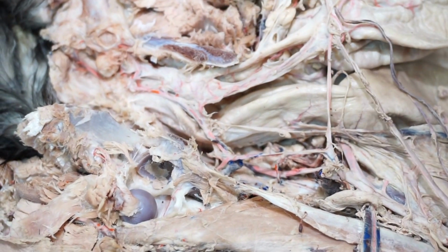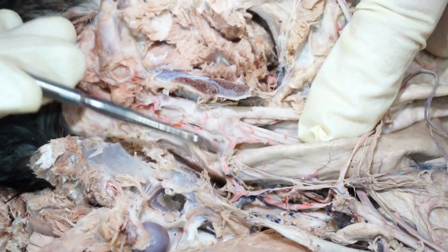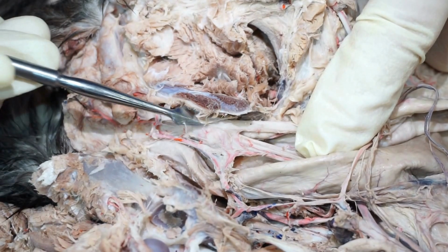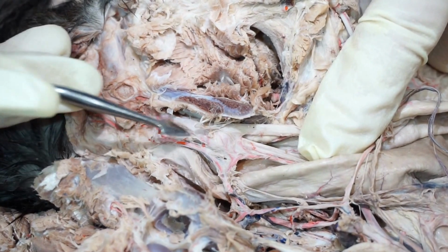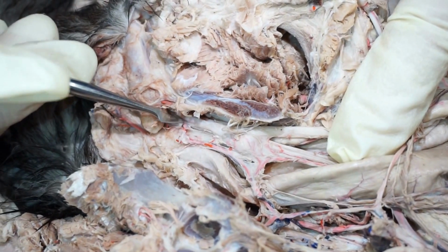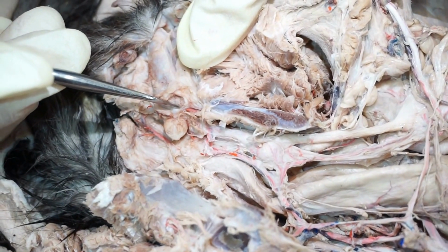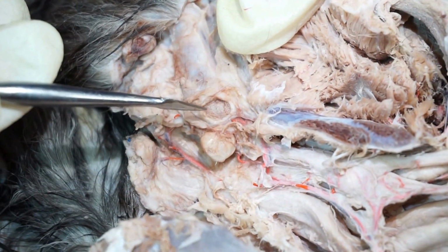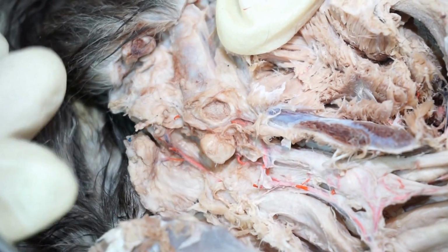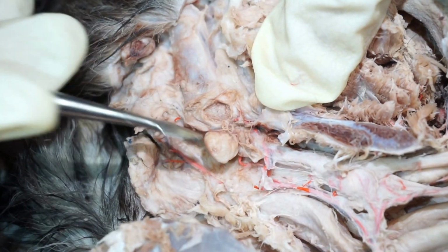I want to point out a few other things in this cat that are unique. In terms of accessory sex glands, we have a little prostate in this cat. Let's move a little bit farther down that pelvic urethra. And right as we start to turn to become the penile urethra, there's this little ball of tissue here, and that is the bulbourethral gland in a cat. Recall, we do not have a bulbourethral gland in a dog.